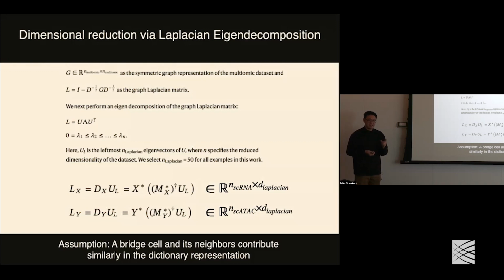The key idea is that for each specific cell, we calculate the modality weight for RNA and the tag. Then we ask which modality has more information there. Then we have a new distance metric, and we construct a single representation for both modalities. And then we can have the SNN graph from that.